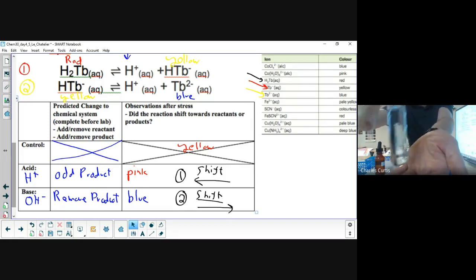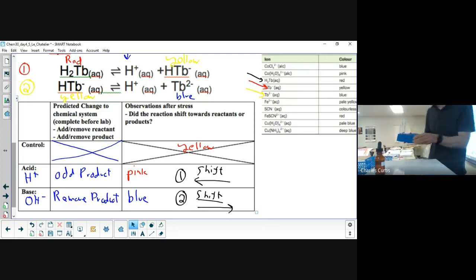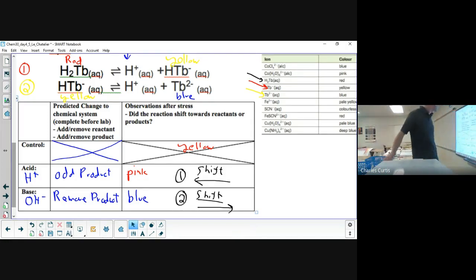So I went from red, I added it so quickly, we went flying through the yellow to the blue. Okay. Again, we're not documenting this one. That's experiment 2 of 3. We'll move on to what is labeled part 4.